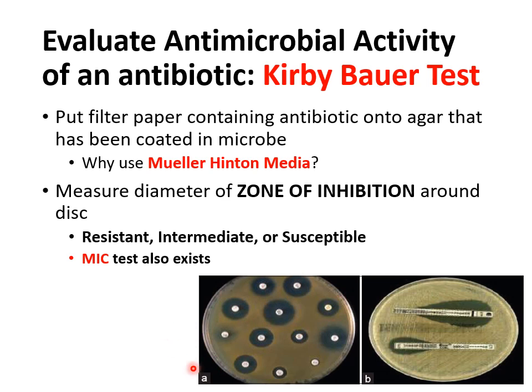So that's the test where you swab the bacteria all over the plate, and then you place different filter pieces of paper onto the plate, and each filter is soaked containing a particular antibiotic on it. And you look to see for each one, does it kill the bacteria and have a nice big zone, or does it not kill the bacteria and you don't see any zone at all?